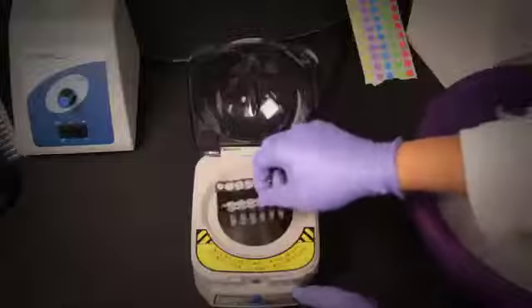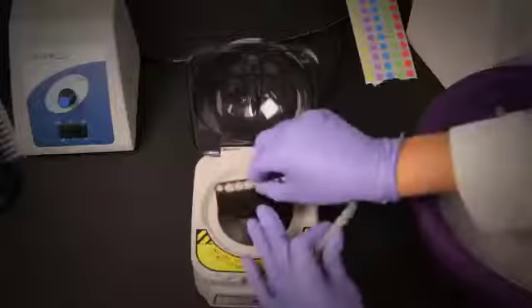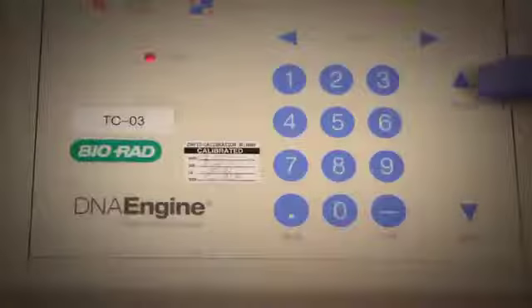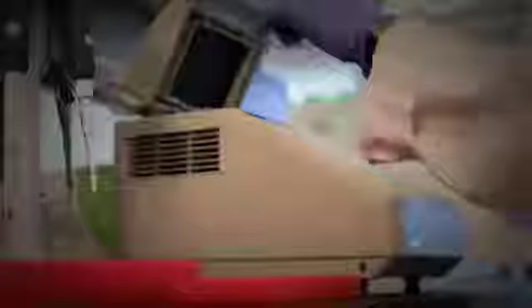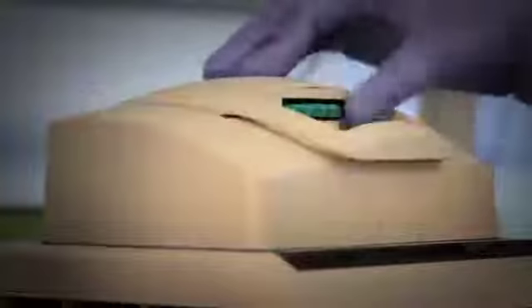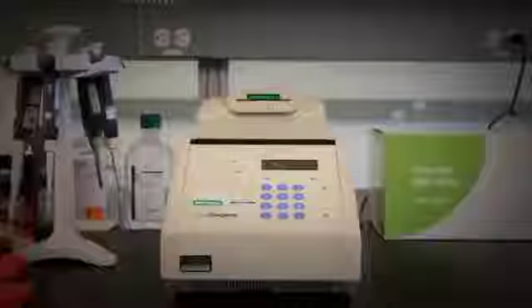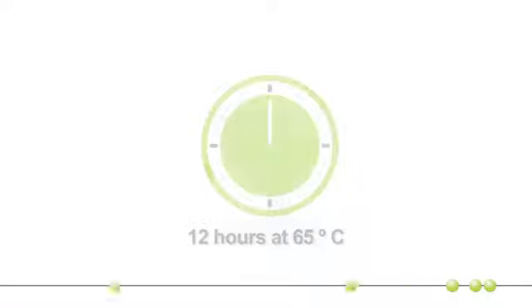Put the tubes in the PCR machine and start the incubation program if it hasn't already started. Make sure that the heated lid feature is activated and the lid is at temperature before closing it down over the tubes. The tubes will now incubate at 65 degrees for at least 12 hours and up to 36 hours.